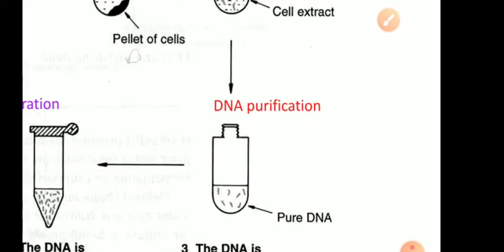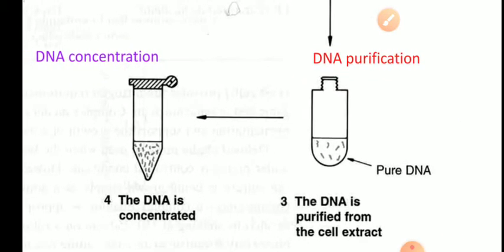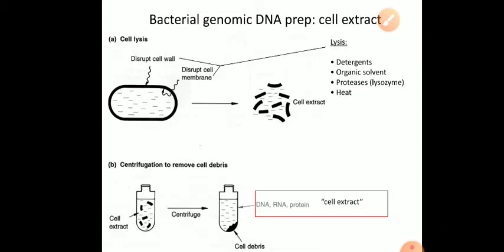Okay, so the next step is DNA purification. Once you get pure DNA, it can be concentrated. So these are the basic steps involved in DNA purification. Now let us discuss the steps one by one.